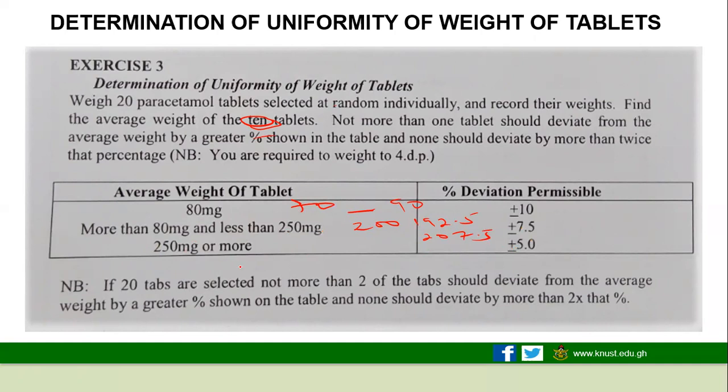Good. Then if you are 250 or more, assuming the tablet is 250 milligram, right? Any tablet that is 245 is considered. Any tablet which is 255 is also considered, right? It falls within the range. It falls within the percentage permissible, right?